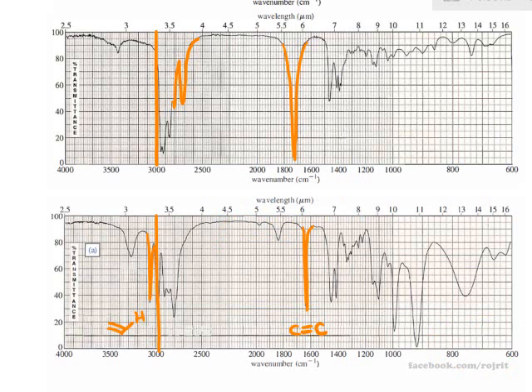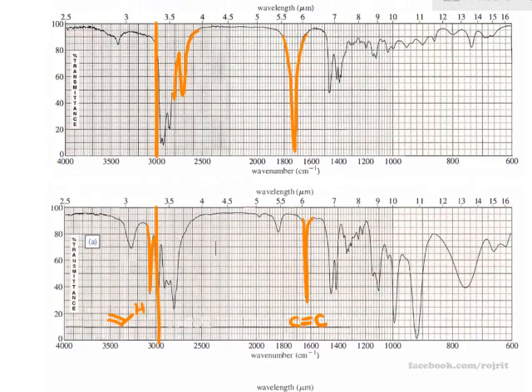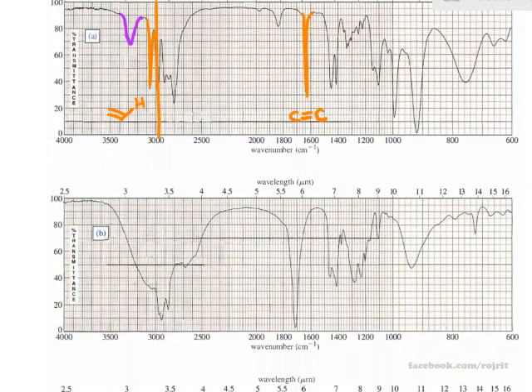But anyway, I'm not very sure whether this is only an unsaturated alkene or whether you have an amine as well. You have a kind of broad absorption, but not very strong, with one spike, one top peak. So this may be a secondary amine. You may answer: unsaturated secondary amine.